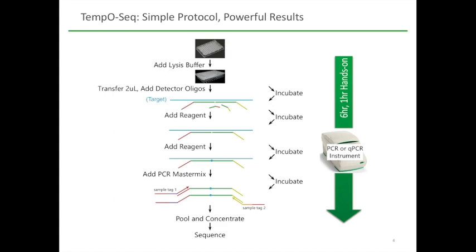This step can be performed in a qPCR instrument so that you can generate real-time signals as an internal QC, but this is not required.